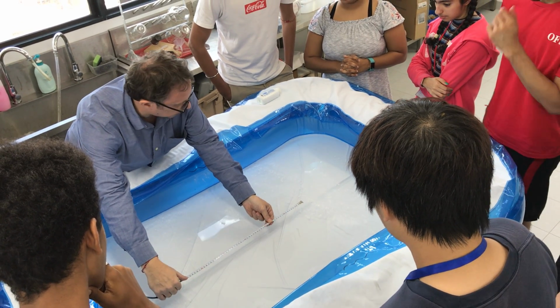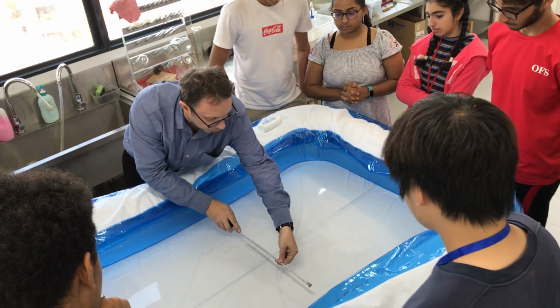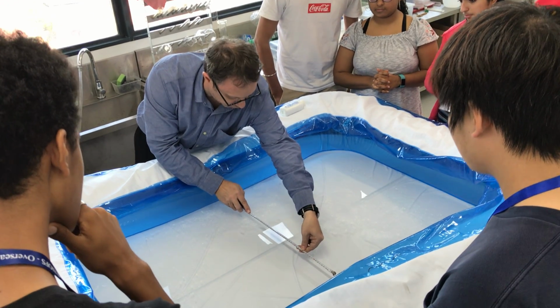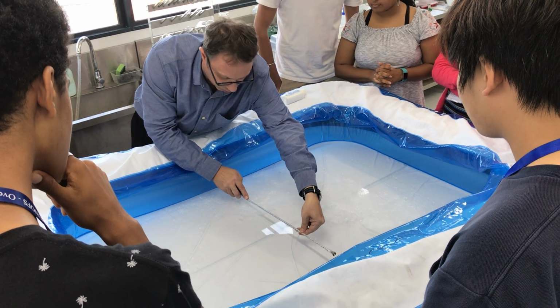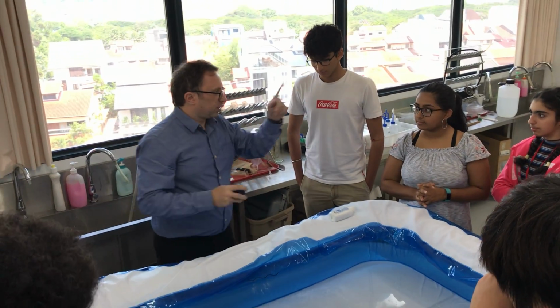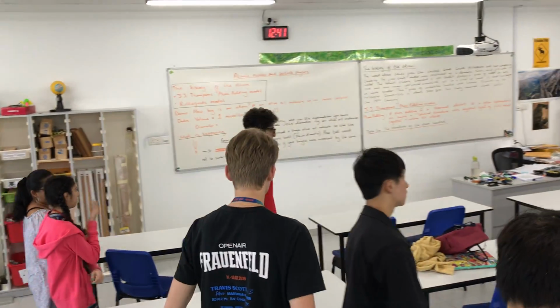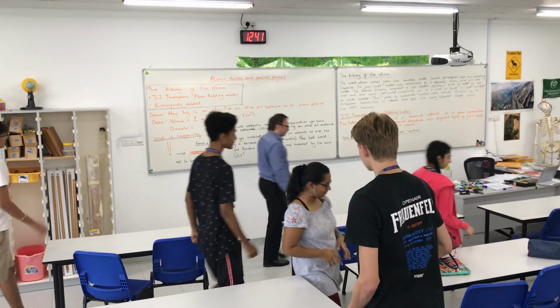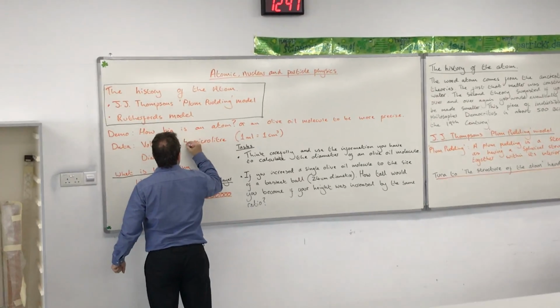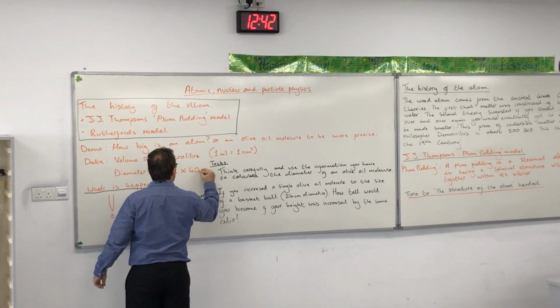so we're on about, I'd say about 56 centimeters across. And if we go down here, we're on about, I'd say that, 40. About, yeah, you reckon 40? Yeah. Right, was that 56 by 40? Mm-hmm. Right, let's get over to the board and we'll fill that in before we forget. I may need to practice this one a little bit more. So that was 5 microliters, and that was 56 cm times 40 cm.